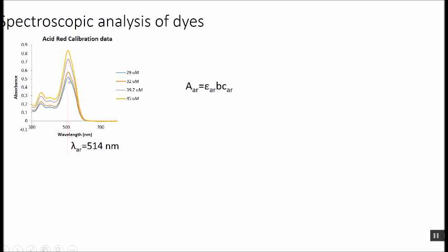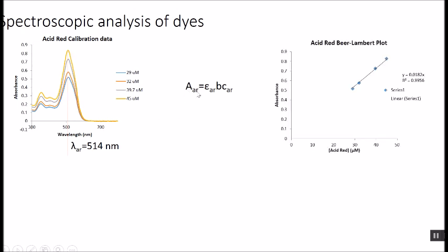We've picked this wavelength because there's a large response of the dye in the absorbance at this wavelength. If we'd picked 700, we wouldn't see a large response. So let's pick a wavelength that has that large response to the dye concentration. So if I make a graph, I'll pick the absorbances at these wavelengths to plot on the y-axis here, and on the x-axis I've plotted the concentration.